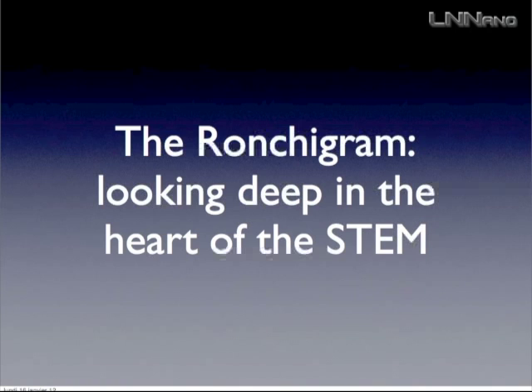This is a very important quantity. Of course, if someone is there and aligns the STEM for you, you may never use it or have any reason to know about it. But if you really want to make STEM experiments by yourself, it's worth knowing it. Just by the way, I was using STEM for 10 years before I learned about Ronchigrams, so you can still use STEM without knowing it.